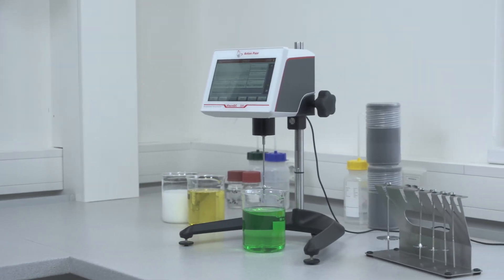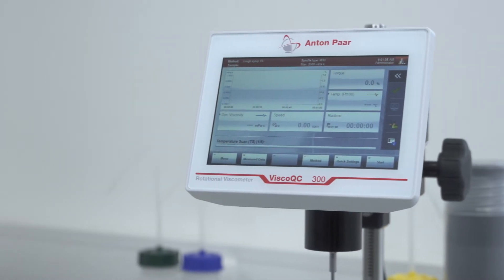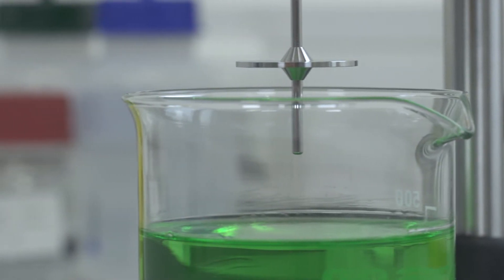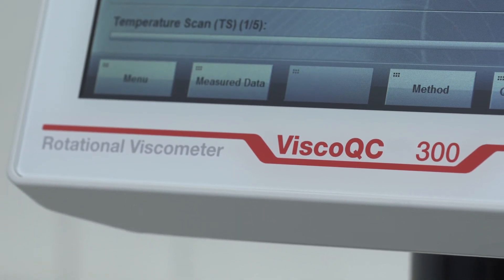Anton Parr presents the new rotational viscometer Visco QC 300, a game-changer in its field. Developed for a wide range of applications, Visco QC 300 ensures the quality of your substance from any liquid to paste-like samples by delivering fully traceable viscosity results right at your fingertips.